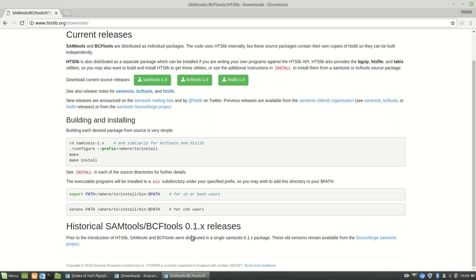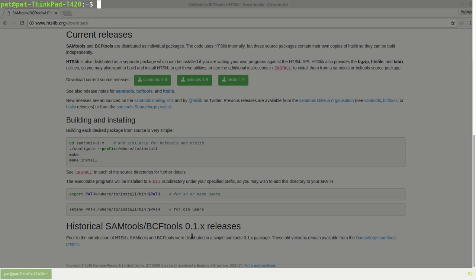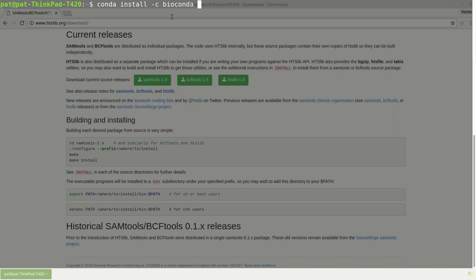For example, I'm just going to bring up my terminal. And I think I actually already ran this, but it's this right here. It's conda install dash C Bioconda. The dash C is just we're looking within Bioconda. And you just type in SamTools. Hit enter. And we'll wait here as it thinks. I already have this installed, so it shouldn't install again.